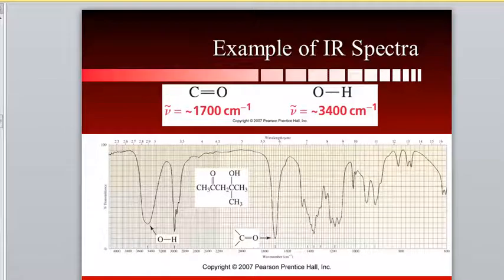So in this infrared, anything after 1400, which basically starts right here, there's all of these spikes that come down and come back up and come down and come back up. I never really bother with those because those are too specific. I can't provide you a general statement on what absorbs where in the fingerprint region.